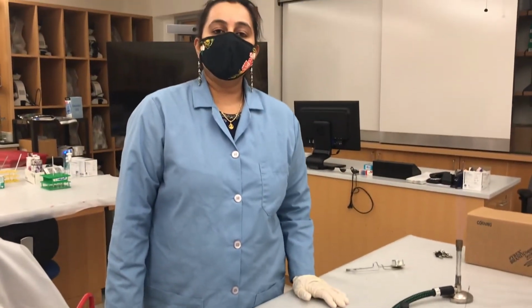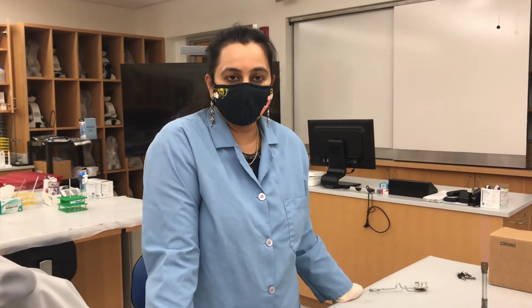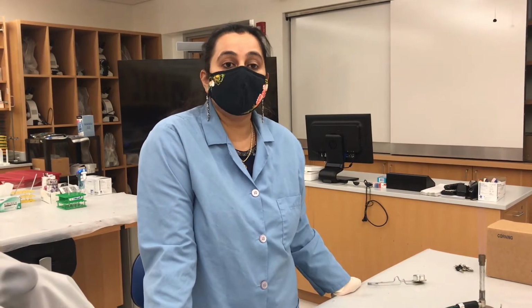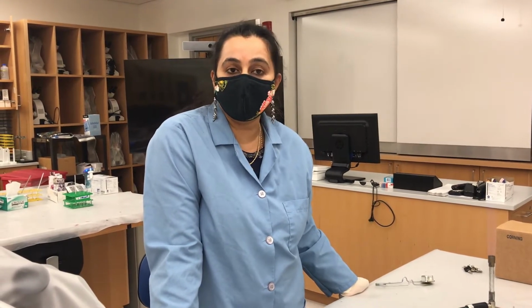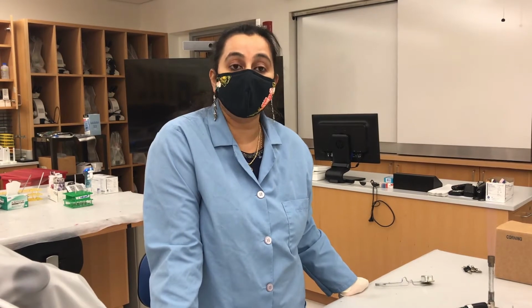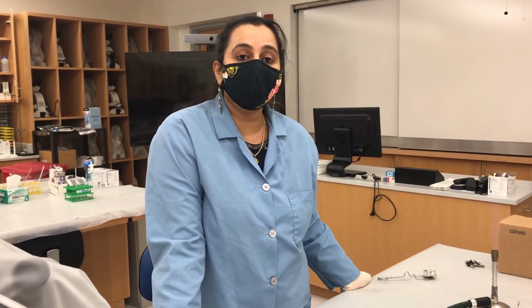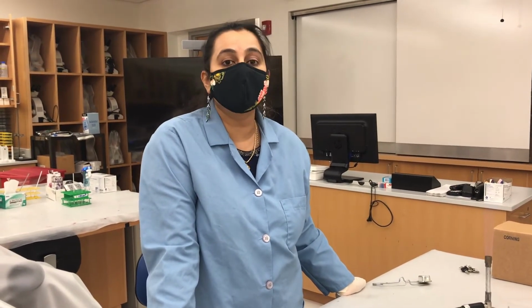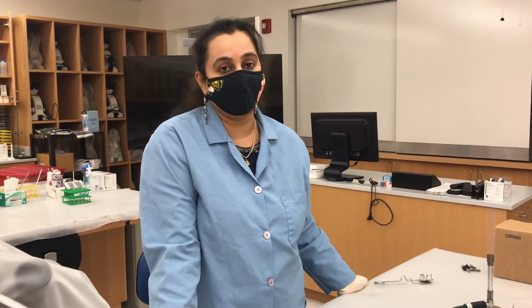Let me explain a few concepts here. So what is the purpose of heat fixing the cells? The heat fixing step makes sure that the cells are sticking well to the microscopic slide. That's one of the reasons why you fix the cells using heat. There is also another reason. You do not want to contaminate your microscope or any of the surfaces around. So that's the reason you heat fix it, so that the heat would actually kill the bacteria.